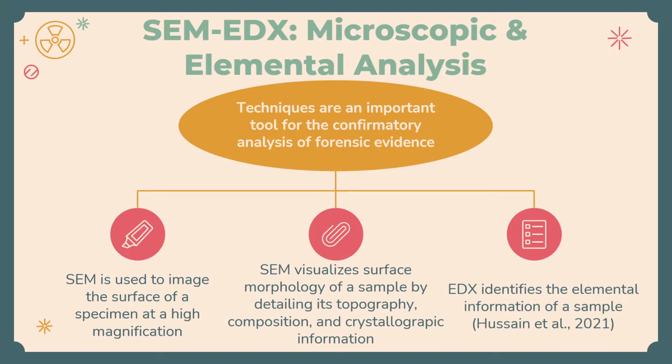So SEM EDX microscopic and elemental analysis. These techniques are a crucial tool for confirmatory analysis of forensic evidence. Sectioning off each of the instruments, SEM is used to image the surface of a specimen at a very high magnification, so zooming in on those different surfaces of that sample.